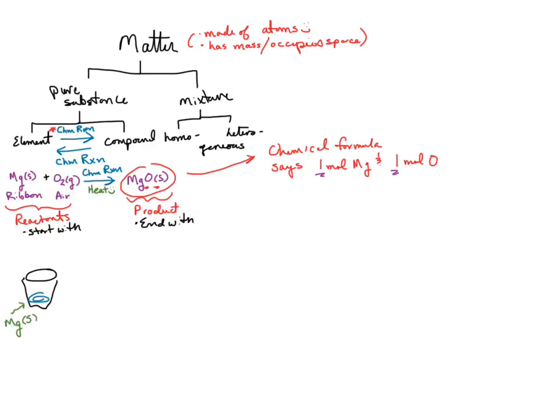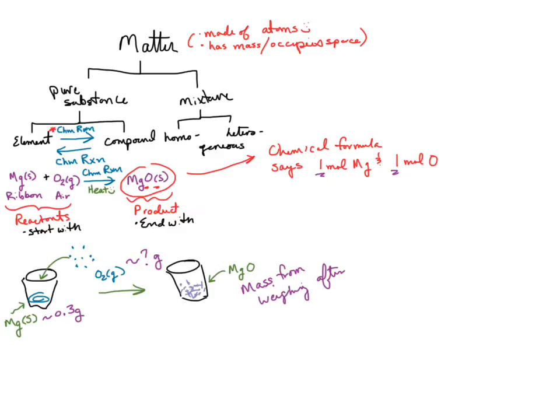So today you're going to be using, this is my rendition of a crucible, okay? It's one of the two things you have in your drawer, or three things if you count the crucible lid. Those are the white things that are made from porcelain. So you're going to be putting your magnesium ribbon, I've got the strips already cut for about 0.3 grams. You're going to be weighing it before you start. We'll talk about that here in a minute. But you're going to heat it up.